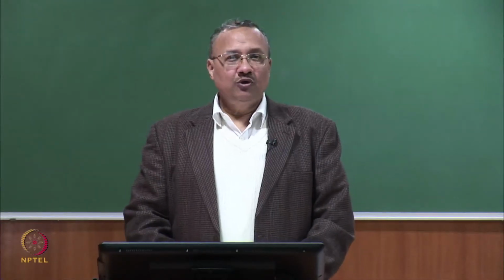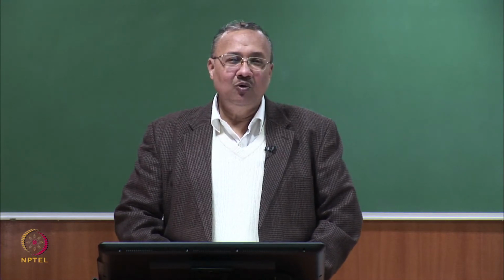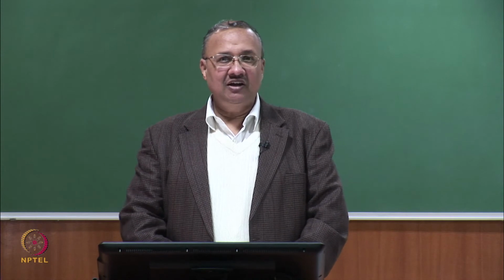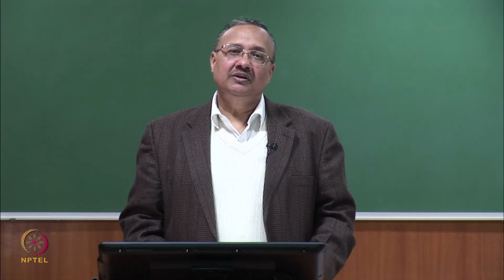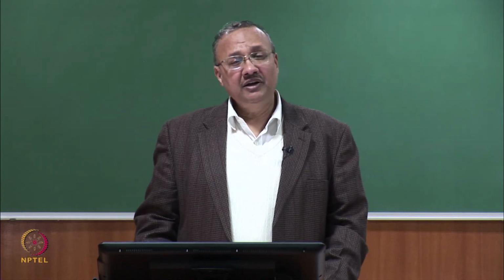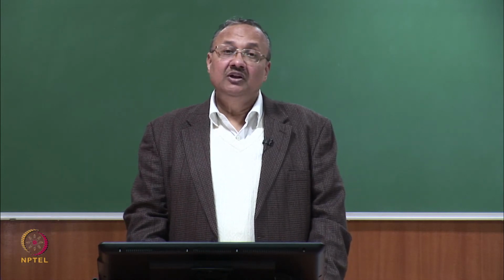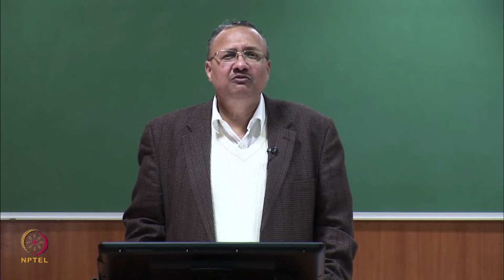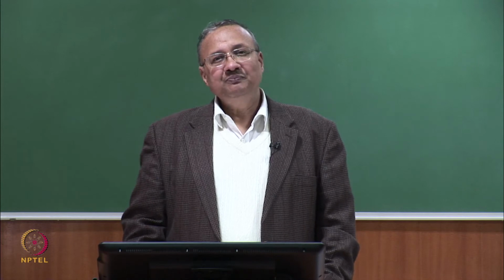So, welcome to the fourth module of surface characterization. I hope you have learned something in the first three, in which we covered FTIR with ATR configuration. We also covered Raman spectroscopy, and then we covered a very important technique, which is XPS, X-ray photoelectron spectroscopy. Now, my last part of surface characterization is something which you are very familiar with, called scanning electron microscopy.